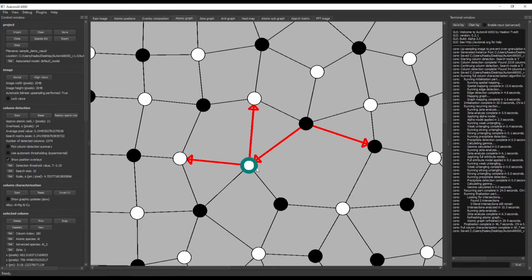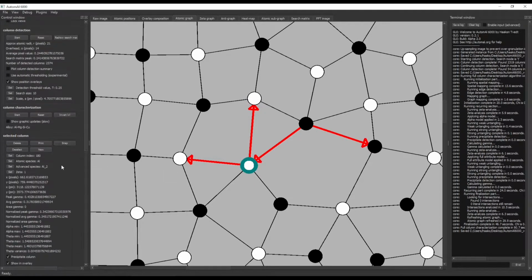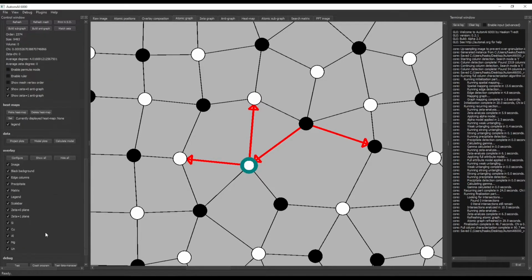This means that the software believes that this is aluminium, which I think is correct. But the structural relationship information is wrong. I realize this might be a bit difficult to see off the bat, but if you think a little bit about it, you will understand. In this case, we won't have to change the species, but we want to change the structural information to be correct.